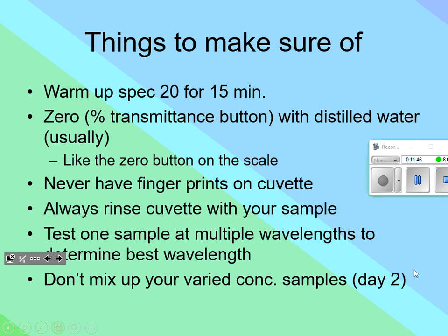You rinse your cuvette. So in other words, what you will be doing today is you'll be putting this blue solution in one of your test tubes. But you don't know what was in here prior. Especially if it's a 3rd hour class today, you guys are going to rinse out your stuff when you're done like a good student would do. But if you rinse something out, there's a little bit of water left on the bottom. And then if you add the blue dye solution, and it's a known molarity, well, if there's a little bit of water on the bottom, what did you just do to your solution? We diluted it. I mean, the thing that we just did a reading about. And if you dilute it, now you've made it not what it's supposed to be.